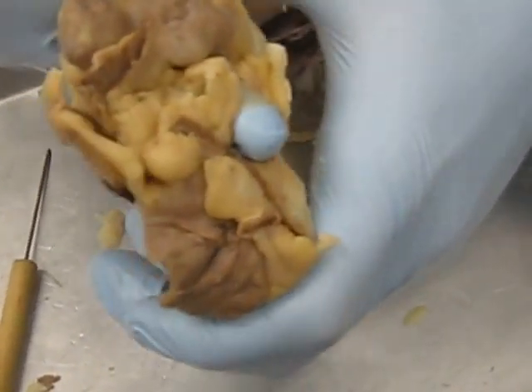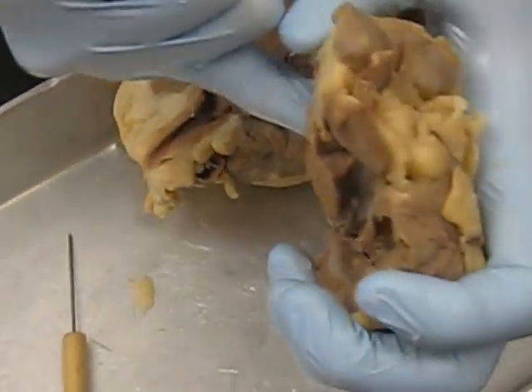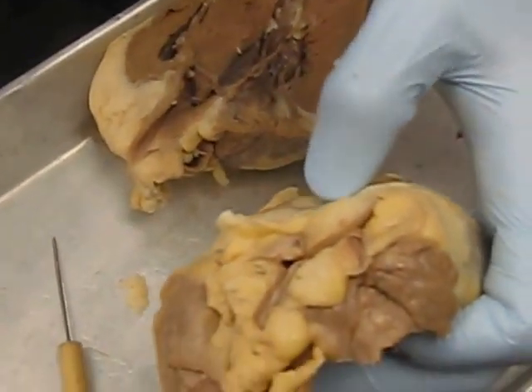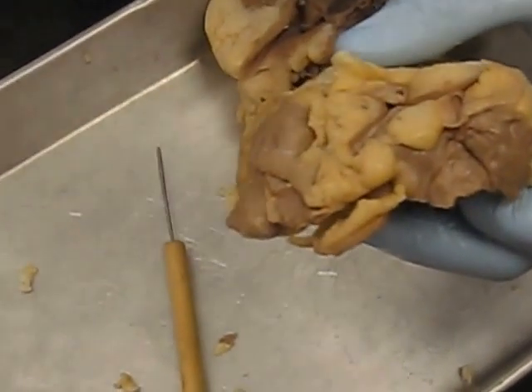Anything that's a semi-lunar valve means it's a valve traveling away from the heart. So from the right ventricle we go through the pulmonary semi-lunar valve, out to the pulmonary artery, to the lungs to get oxygenated, and then oxygenated blood travels back down the pulmonary vein.